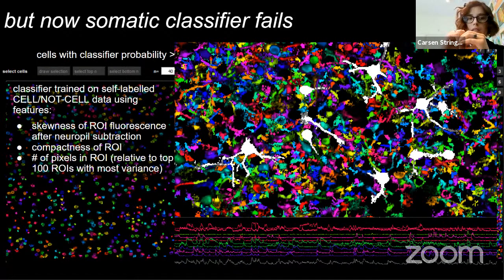And then if it's, I guess maybe we define it opposite, but basically if the pixels are kind of dendrites, we get larger compactness levels based on, that's what comes out of Suite2P. That's how we define it. And those end up getting thrown out by the classifier.